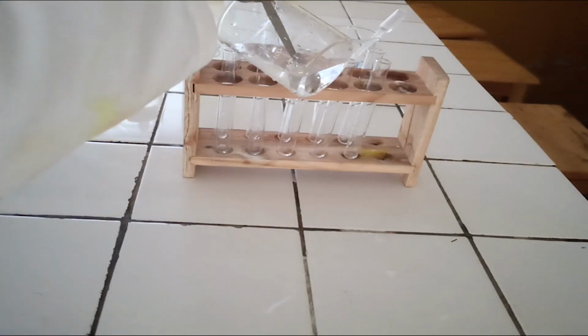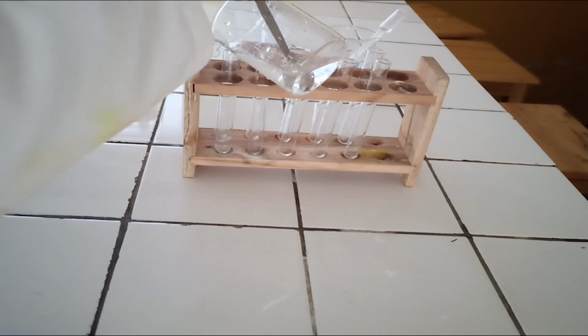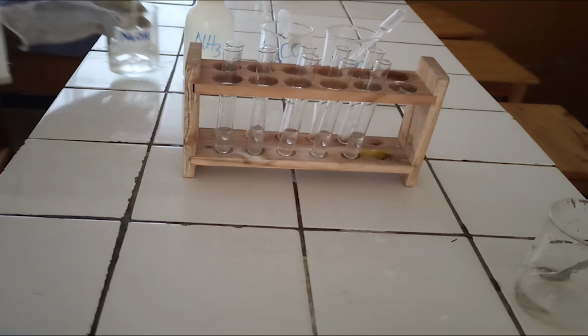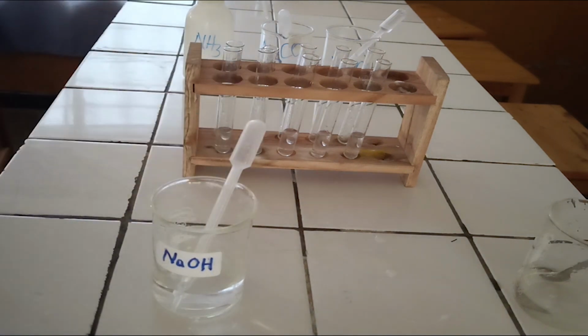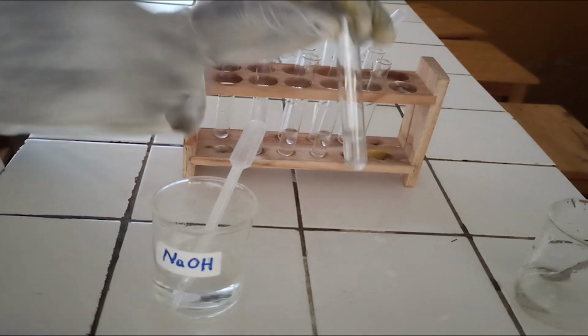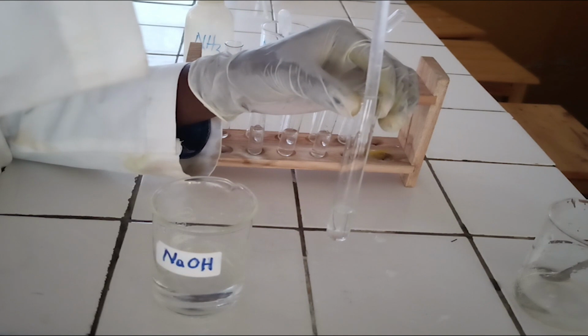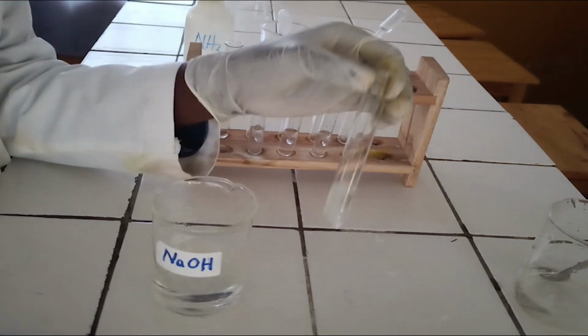Third step, divide the solution into test tubes, put around 5 ml in each test tube. Preliminary tests. To the first test tube, add sodium hydroxide solution dropwise until in excess.